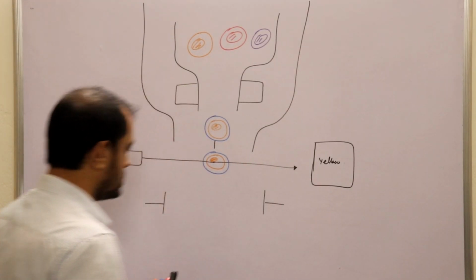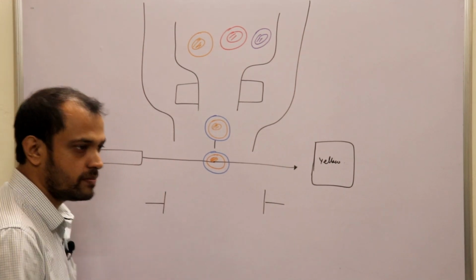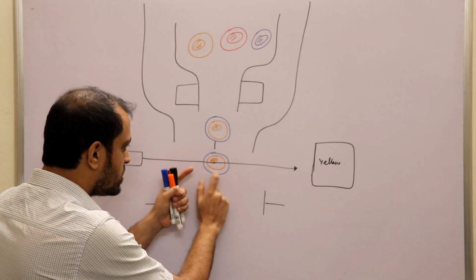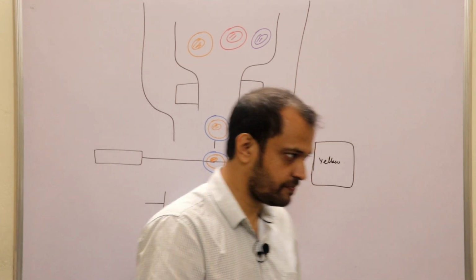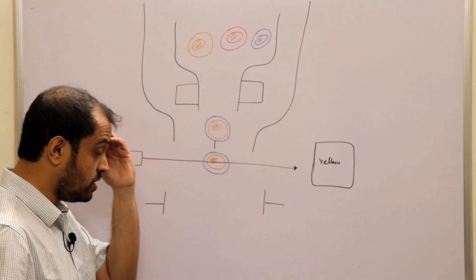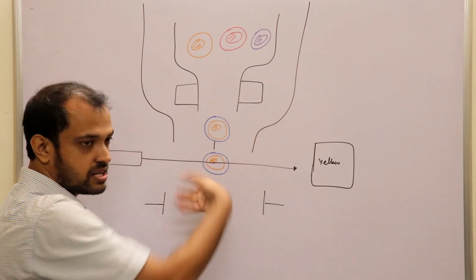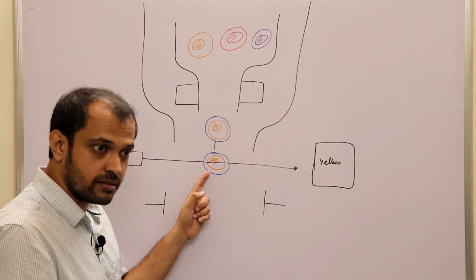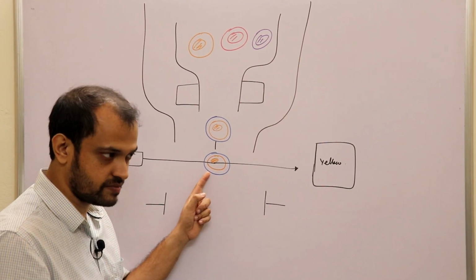So we were discussing that, suppose we take into account that this particular drop containing a yellow cell will have a positive charge. Now who is telling this particular system that the droplet containing the yellow cell will have a positive charge? Who is saying that?